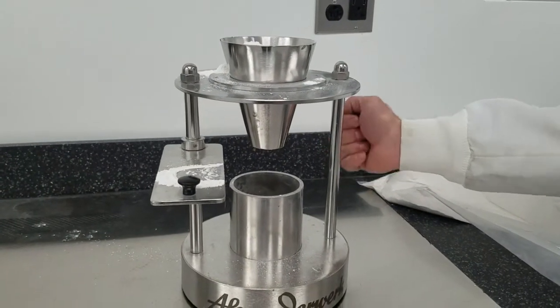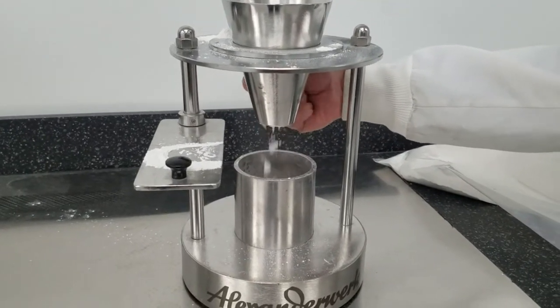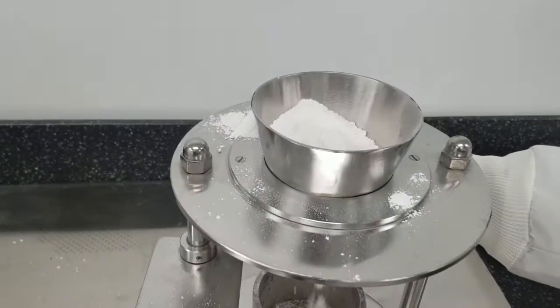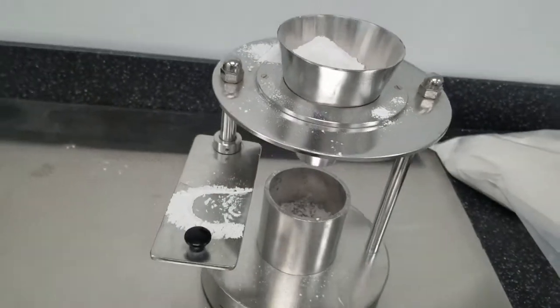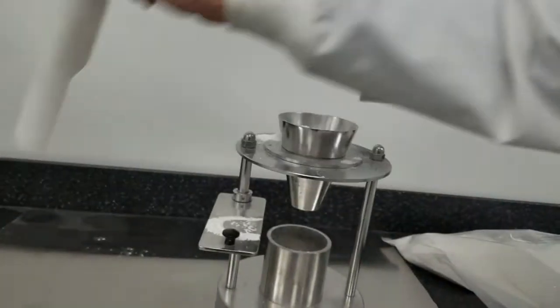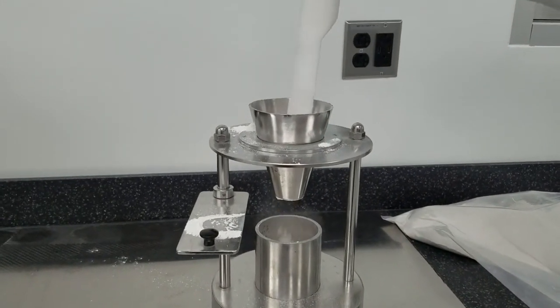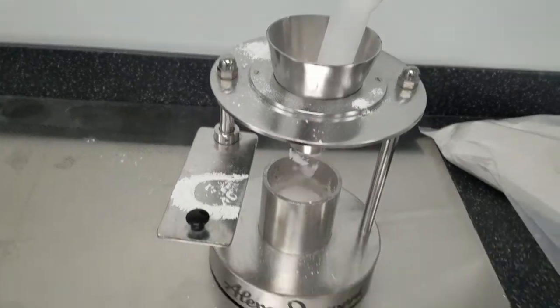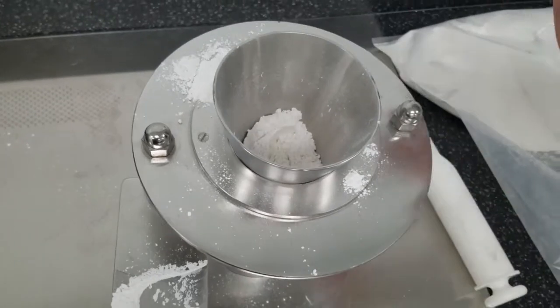I can tap the hopper a little bit, which starts encouraging the material to flow little by little. If I keep tapping it, it will come out eventually, but usually what has to be done is I have to somehow give this material a little bit of a push. You can see it's starting to flow — it's also really, really dusty. You can see the dust starting to form left and right as it's falling into the sample cup below.